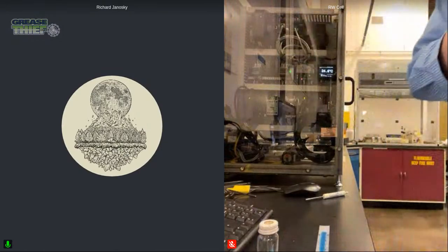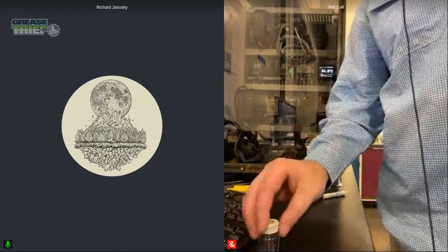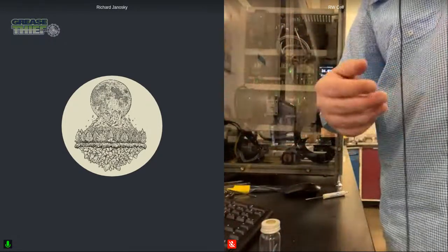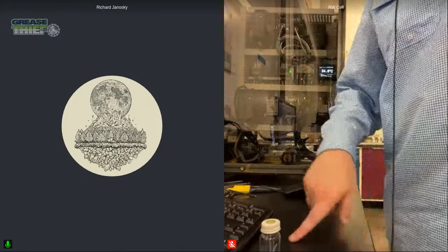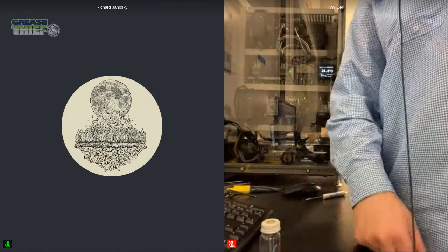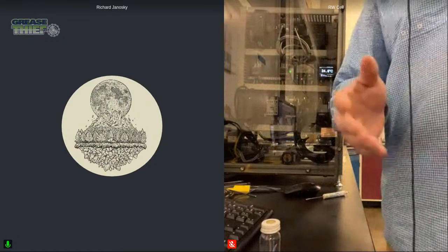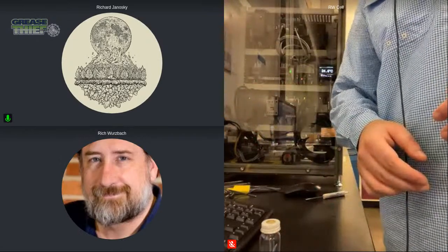Sometimes, in certain applications, the customer might not be able to get a full gram. And so in that case, they're only going to use 1 strip or possibly a strip and a half. So there we would know the ratio of grease. Since we're putting in a half gram of grease normally and 10 milliliters of solvent, we can do our math, and we know with a lower weight the volume of solvent to add. That way, if we have a lower volume, we're not running a different dilution, and we're always keeping everything the same for our analysis. So that's another advantage that the strips help us, allowing us to have that kind of control. So this is about being able to create a consistent concentration for some of these, and then in other cases doing a mass normalization, right?